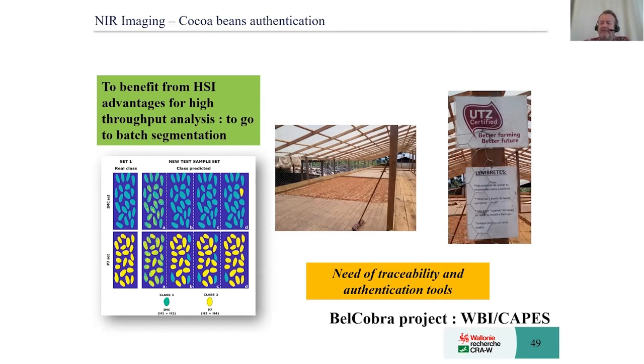And so the idea is both. It's a way to have a technique that, at the production site, in South America, in Africa, and so on, we can use to check if the material we produce is top quality. And also in a European country, to be able to check the raw material at the single kernel, the single bean in this case, level. It's very important because when you have in one batch only a few kernels that are not very well fermented, it can damage the full batch. So you have to check carefully. There is a procedure to do that. It takes time and it is destructive, but here we succeeded in developing models that allow us to say whether a bean is well fermented or not. When it is well fermented, you develop the aroma that you look for in chocolate, and so you can make fine chocolate. That is what we are looking for mostly in Europe, so that's quite important for us.